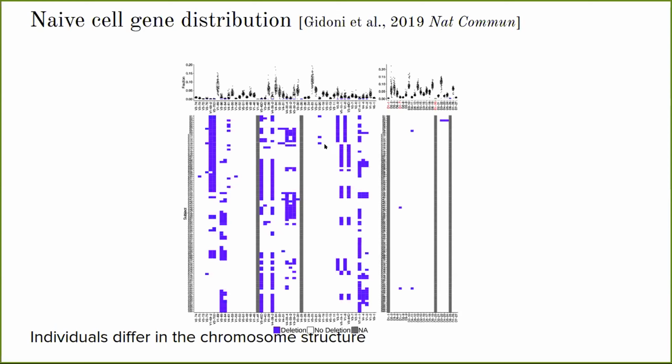And not only that, there are also another couple of genes that are deleted together. So this added another layer and shows that there are patterns within the chromosome when we look at the deleted area, and not only at the usage. Also, a lack of usage is a variation.